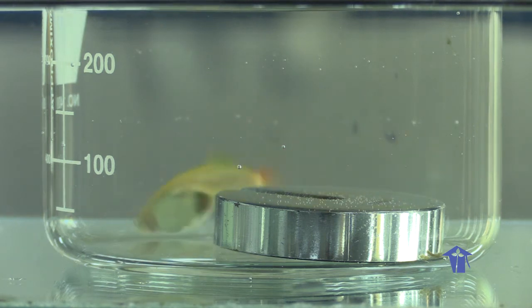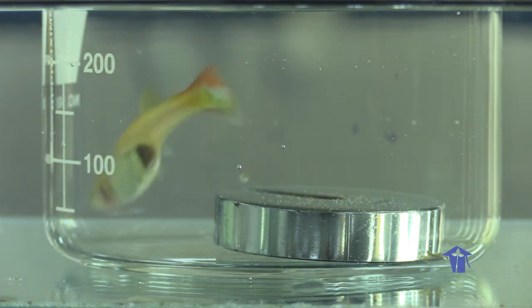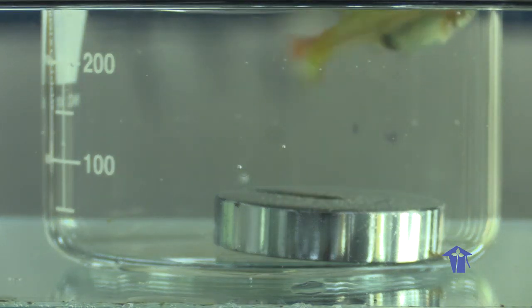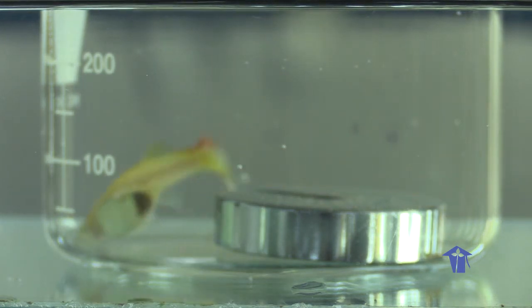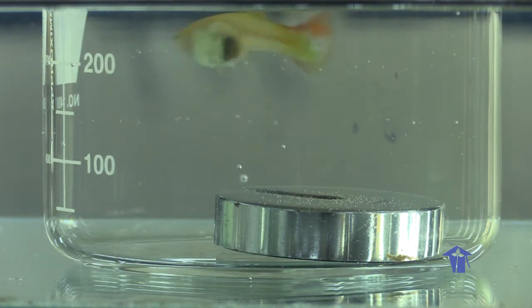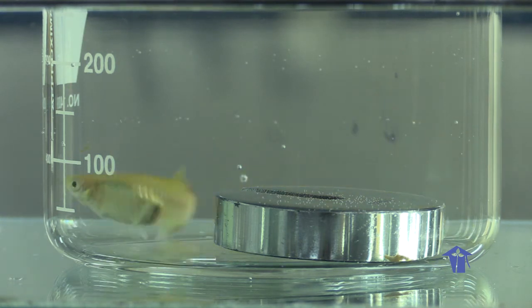and we're going to try to calculate the number of beats per minute by getting an average of the number of beats in every 15-second interval. And then you can use that value to calculate the beats per minute. So during the recording, at each temperature, you will see the video is provided for a minute. During that minute, you have to record the number of beats in 3 intervals of 15 seconds. And then those values will be used to calculate the number of beats per minute, and an average of those 3 values will be used to plot your data.